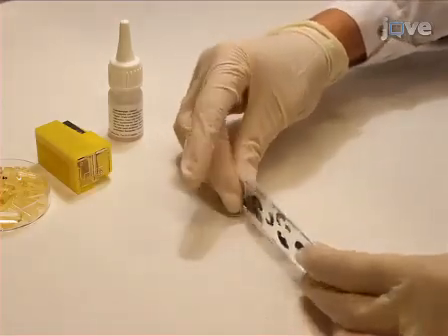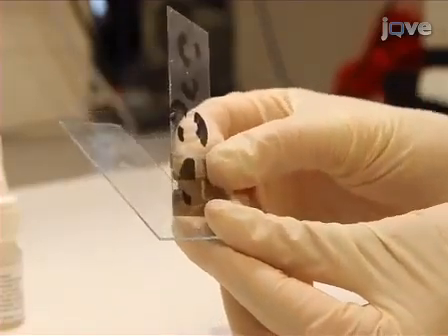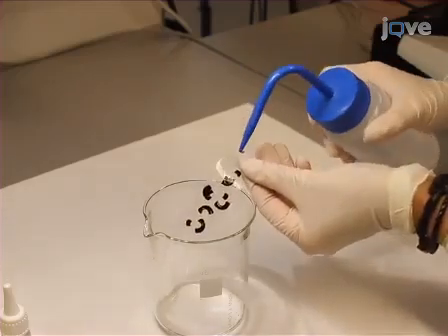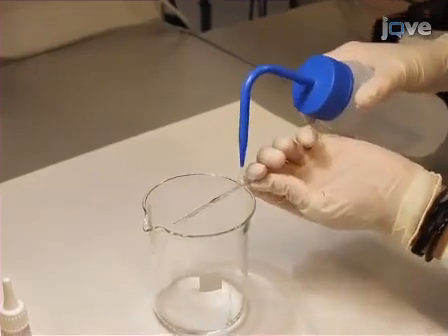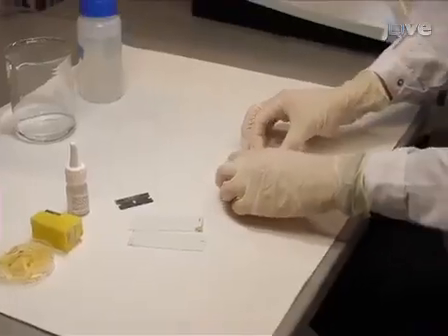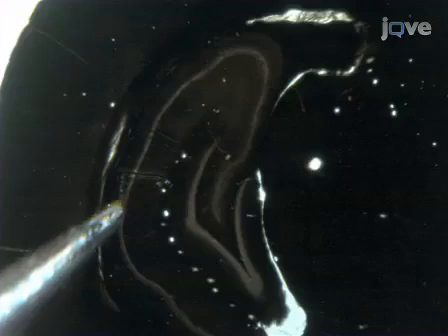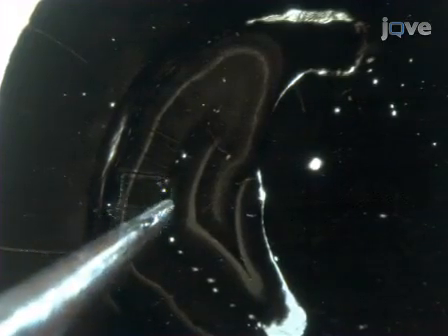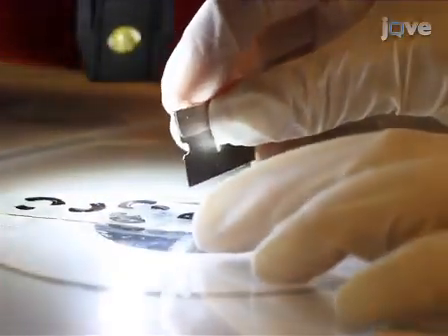Gently push a razor blade between the glass microscope slides and remove the resin layer containing the samples from between the slides. Holding the resin layer with your fingers, gently wash the sample under running water to remove any mold separating agent. Place the sample under a dissecting microscope with transmitted illumination. Using a low power objective, mark the region of interest with a fine needle. Use a razor blade to cut a small 3mm by 3mm square around the region of interest.